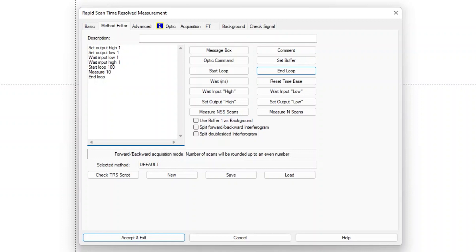You can also run subsequent measurements with different time resolutions. For example, we can set a first loop taking 100 measurements while having 10 scans per measurement, and then start a second loop taking only 5 measurements but with 1000 scans per measurement. This programmed measurement series delivers high temporal resolution for the beginning of the reaction and cuts down the data volume in the slow phase of the reaction without changing the scan velocity.